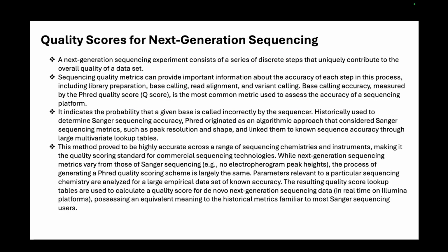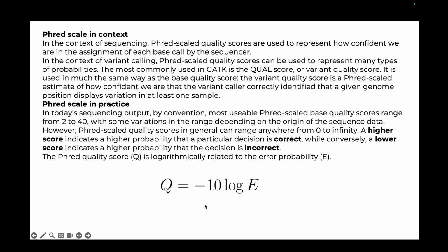Okay. Now you have done your sequencing. You have got the data: at what position, what base is there. Now, when the base caller software is identifying the pictures from the sequences and predicting a particular base at that position, that is obviously prone to error, right? So we have an associated quality score for every base that has been sequenced. What is the quality score? It's pretty simple: minus 10 log e, where e is the probability of error.